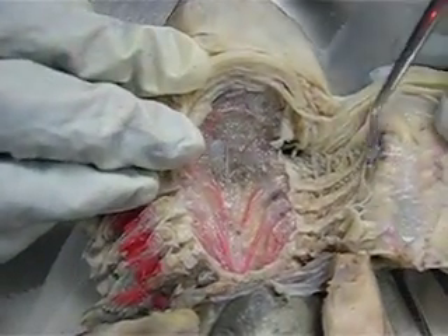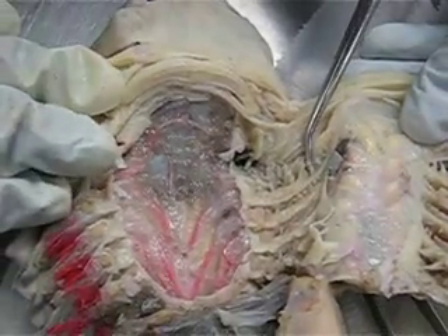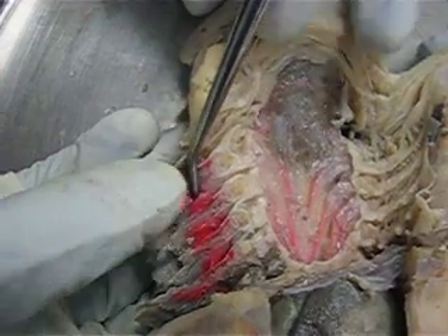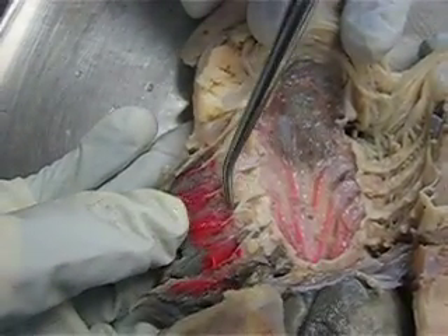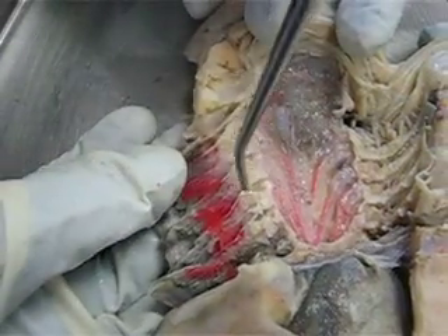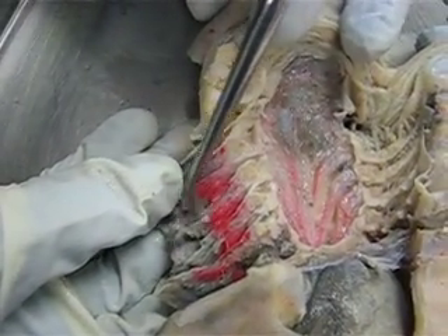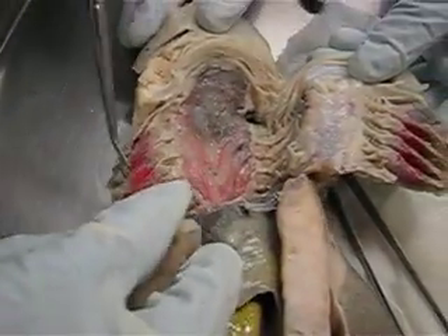Moving into the gills, right here, these little tooth-like projections are the gill rakers. These pink structures right here are the gill lamellae. This cartilage right here is the epibrachial cartilage. And we have our internal gill slit right in here. Our gill pouch is going to be right here. Our gills are separated by an interbranchial septum, which is right in here. And then we have our external gill slit, which can be seen from the outside of the shark.